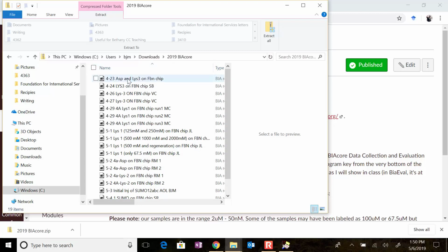The other thing is I'm thinking we maybe should have two different files, or did we do it all that day? We did it the first day, and we had people come back. Angelina came back much later, and then, oh, Samuel, this is the one that you came back for your initial injections. I'm just trying to find those because that's what I wanted to show you how to do. So this is Samuel's initial injections. This is everyone else's initial injections.